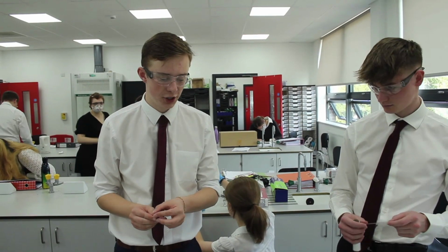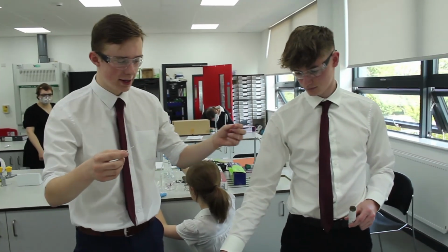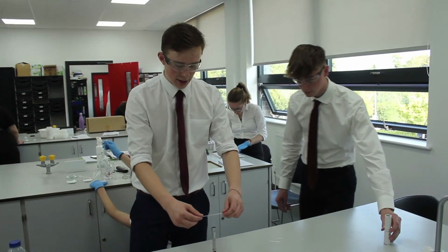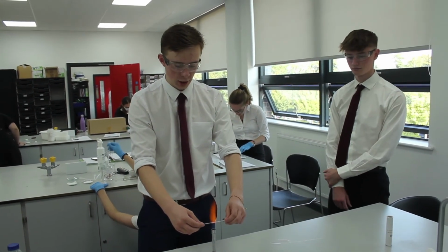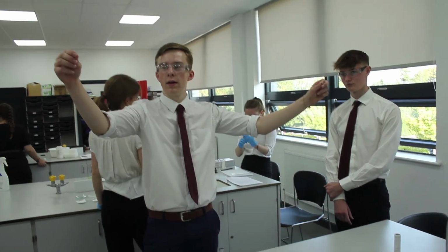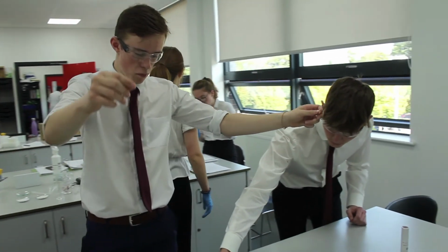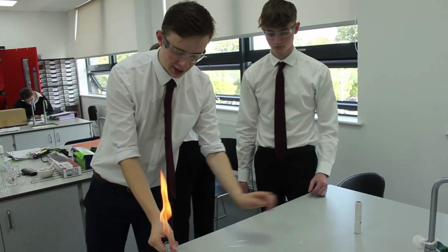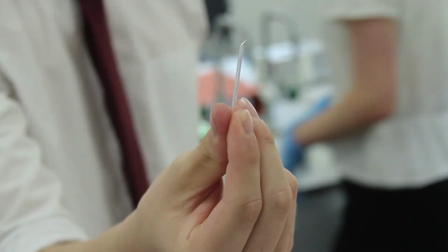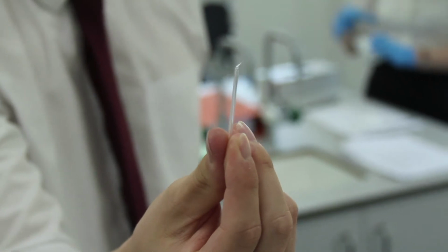We have these glass capillary tubes. They're hollow, and we heat them over the roaring flame, like so, until the glass in the middle starts to get liquidy, and then we pull it apart. And it forms this big strand, and then what we can do, we break the end off, and it forms this little thing here that can be used to drop small amounts of liquids onto chromatography paper.